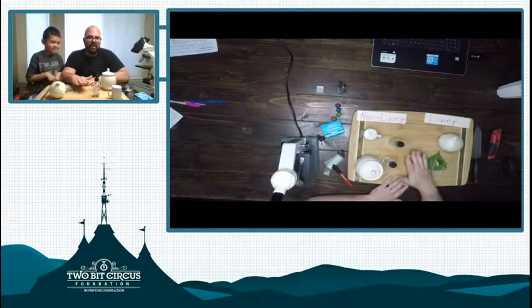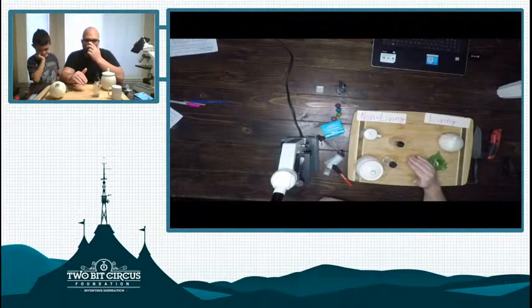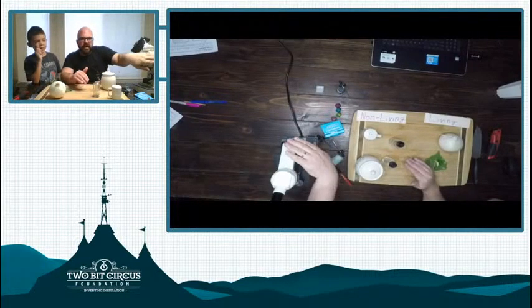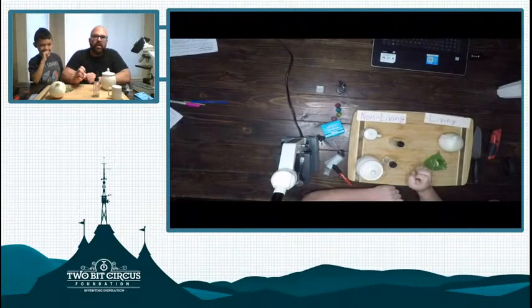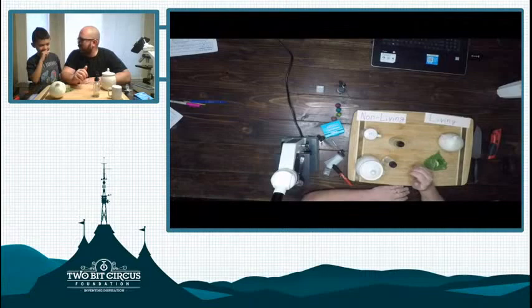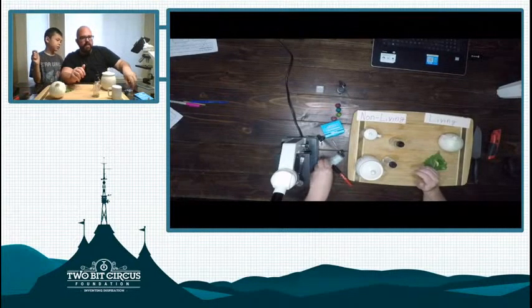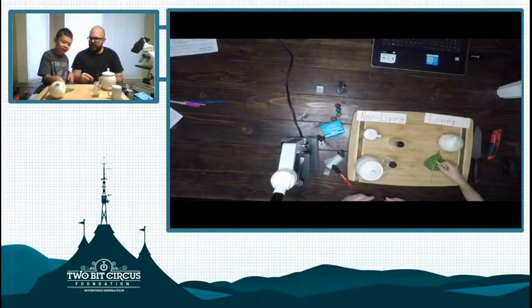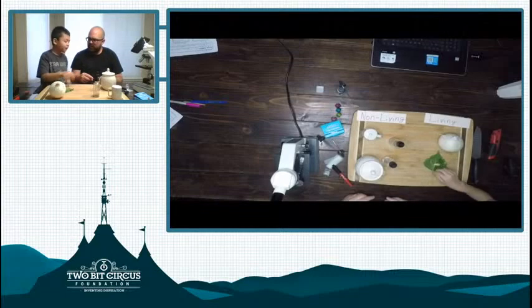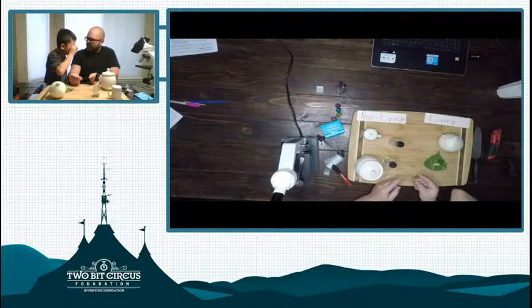So we have living and non-living things here. And we have a microscope that I don't know if you can see. You can see it right here, a little bit on camera. And we have a camera hooked up to the microscope to share with all of you as we do our experiment today. And for the experiment, what we're going to do is we're going to take little... Yes, go ahead, Robert. Tell them. We're gonna take a little piece off and then put it inside here and then put it in the microscope. See if it's alive. Awesome.